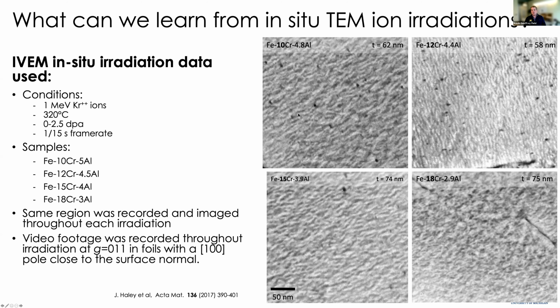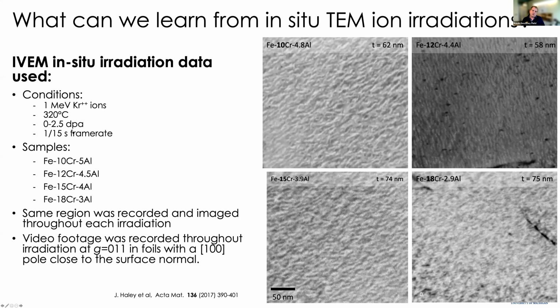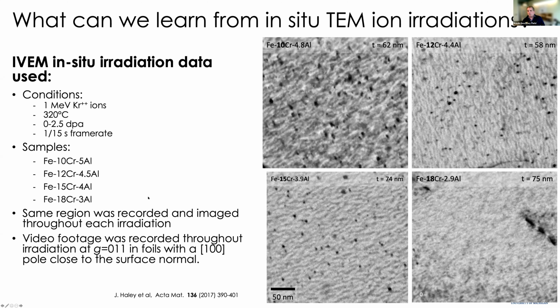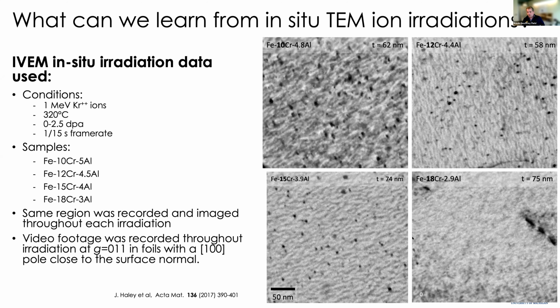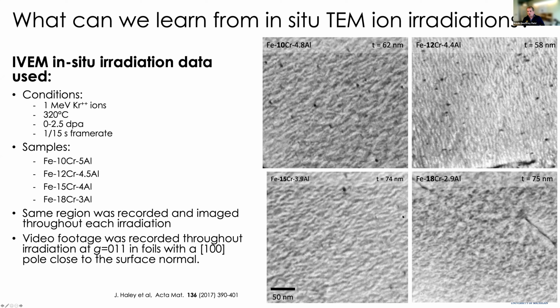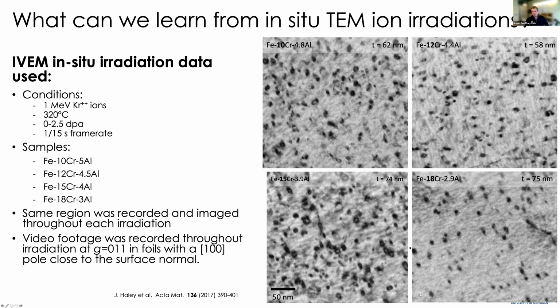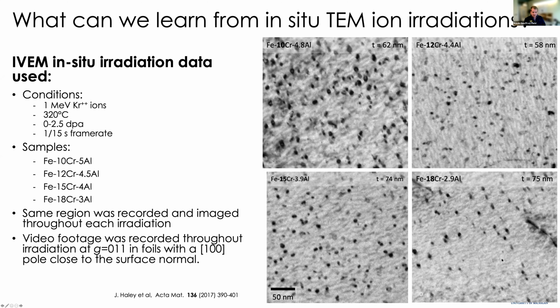The nice thing is that you get very good growth rates as a function of dose across these different compositions, so we can ascertain the performance of the different materials. You can see that across all 4 of these. Sorry if I'm giving you a seizure with the amount of data running at the same time, but it's the easiest way to show it without running over for 2 hours, clicking on every movie.